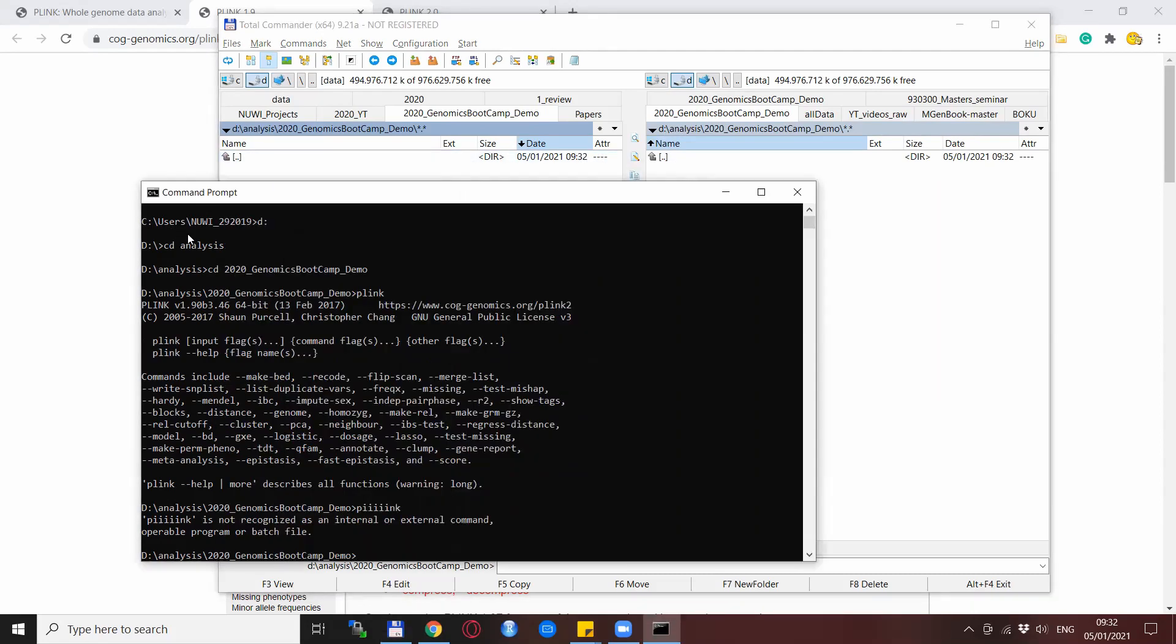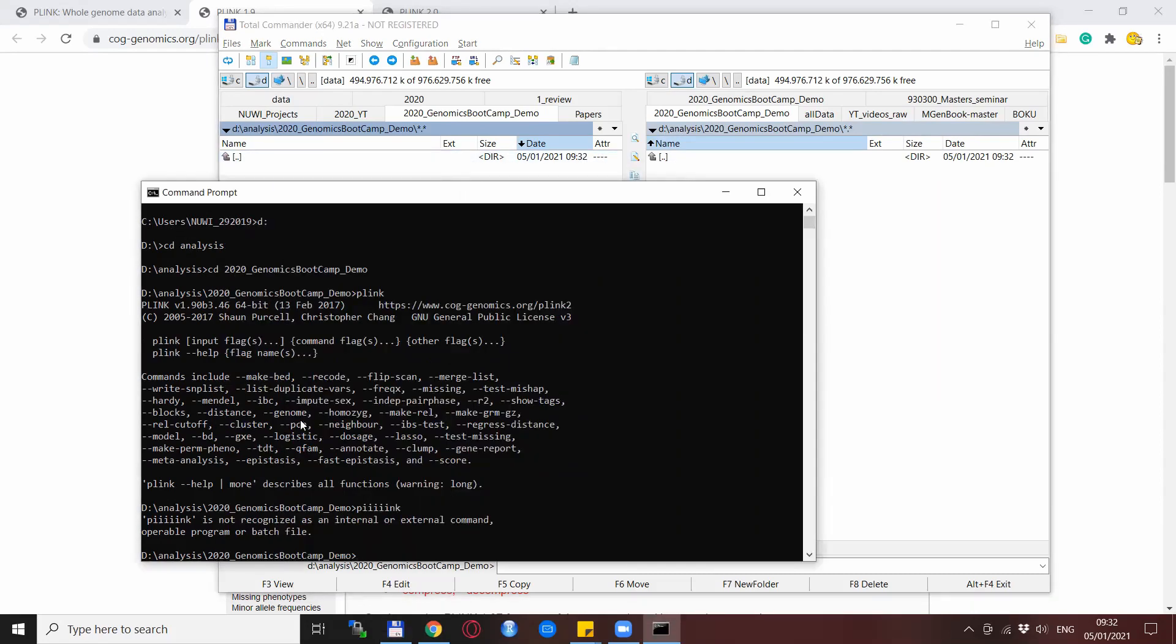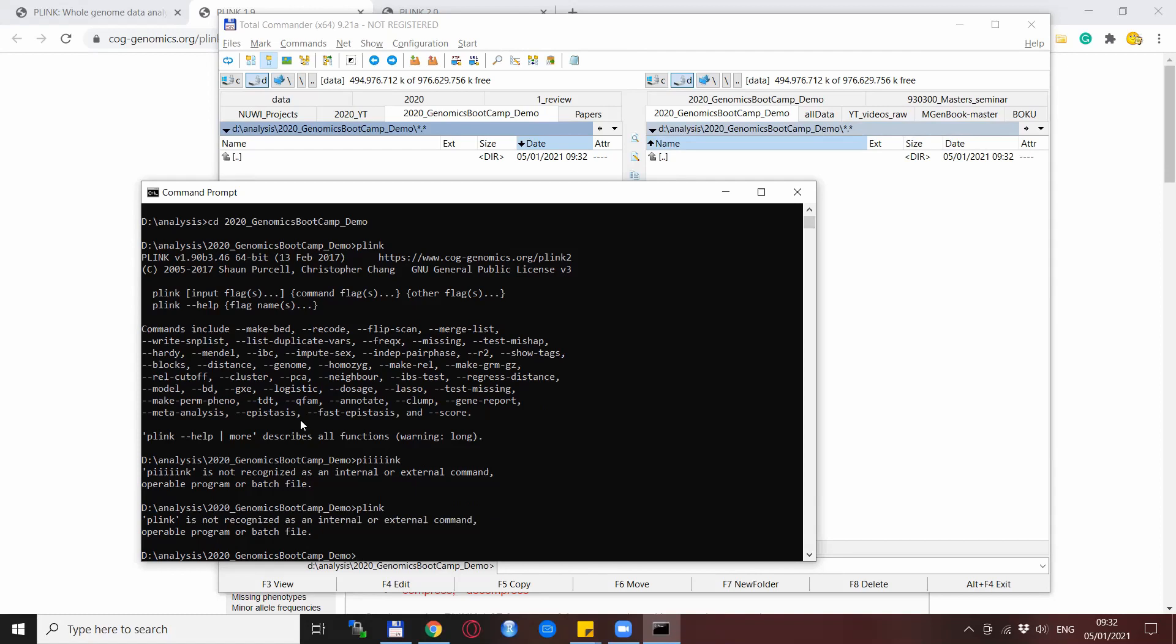So we now deleted the plink file and now we will try to start it normally. But again what we have here is a similar error message that it is not a recognized internal or external command. Which means if you see this kind of an error message then you will have at least some clue what to look at and how to solve it in the future.